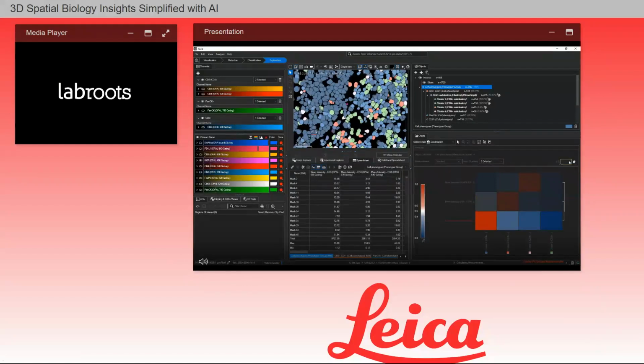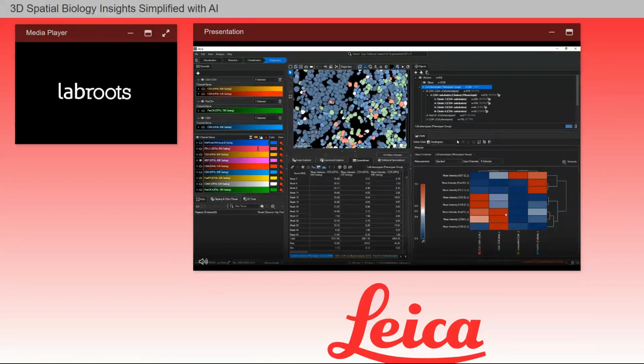You can see that each cluster also has different intensity levels for the other biomarkers. If I wanted to look at which channels I used for training the phenotyper, I can go to Options and select Show Table. This will show me which measurements are used in teaching each phenotype in the phenotyper.